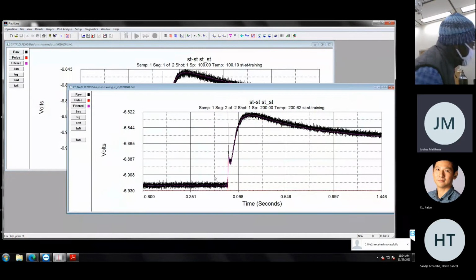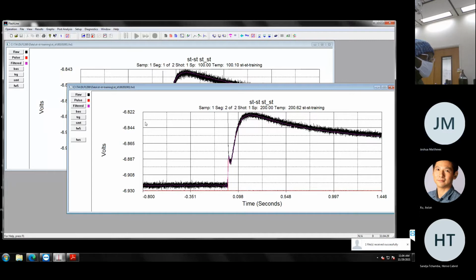So you can see that the amplitude is low here, right? It doesn't look like we were getting as much, and we weren't. We found out that we needed to adjust the positions of the sample holders, right? And you can see that we basically got no rise, so no signal from the detector. Also we have a step and a little bit of shine through. So this, you mean the voltage, right? Yeah, the voltage. So this is very low.